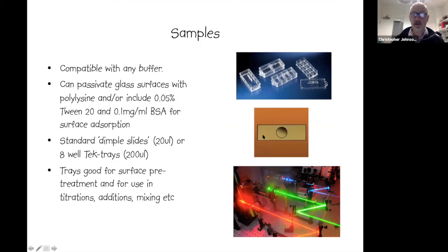That would be either a cover slip, a slide with a cover slip on it, or these so-called tech trays, which are plastic trays with an optical cover slip as a base. We can passivate the surfaces using polylysine.